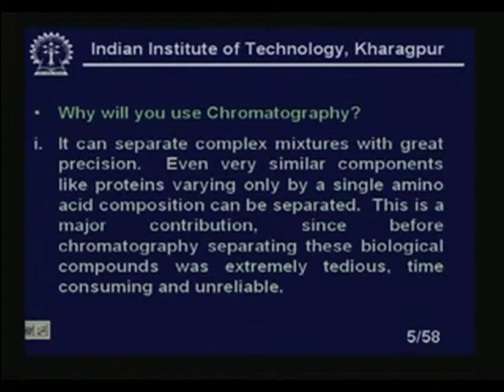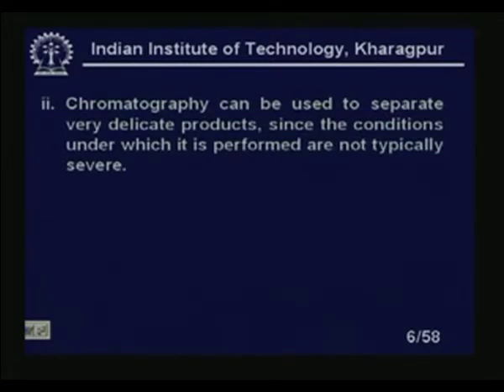This is a major contribution, since before chromatography, separating these biological compounds was extremely tedious, time consuming and unreliable. Chromatography is quite a reliable instrument in that sense. Chromatography can be used to separate very delicate products, since the conditions under which it is performed are not typically very severe.